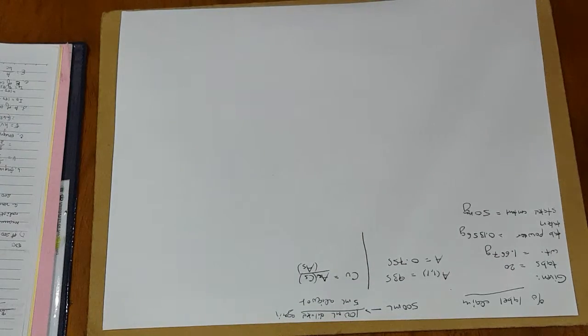So all you want to know is the label claim actually, are they actually telling you the truth? For example, they say our tablets have 50 milligrams of the active constituent. So by doing this UV vis, you can actually tell if it's actually 50 mg, if their claim is 50 mg. So here we have a given problem.